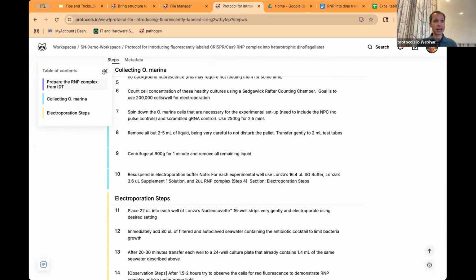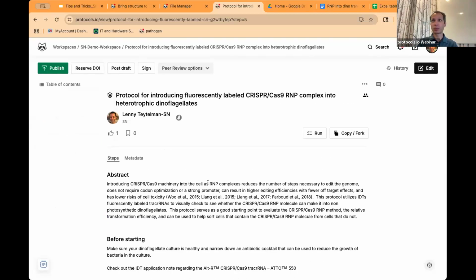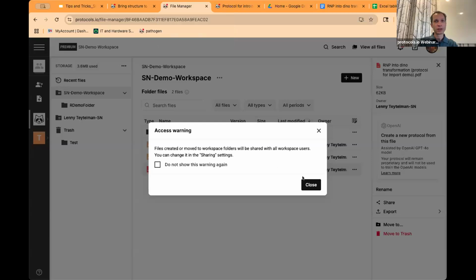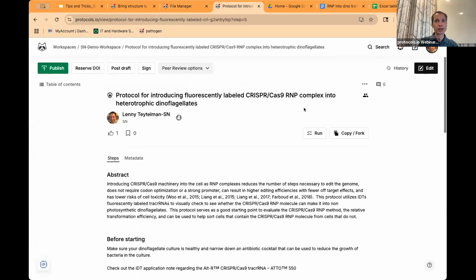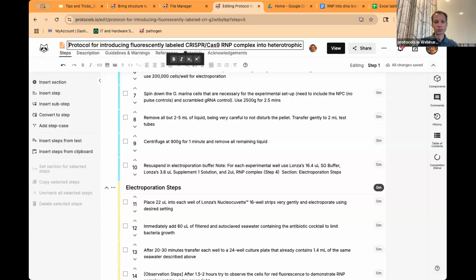So sections are highly recommended. And we've finished putting in the protocol. It took 5 minutes to do it manually. And now let's compare the manual import to the automatic one. So actually they have the same title. I should have called, let me go back here and rename it manual.